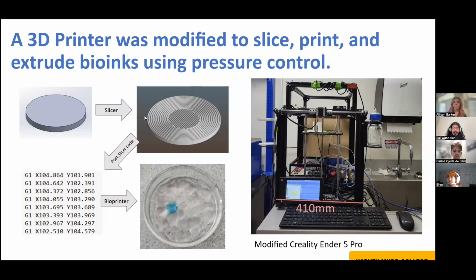In order to get the bioprinter to print an actual file, we devised the following system, which corresponds to the flowchart on the left. First, the object to be 3D printed is added to PrusaSlicer, a program that converts a 3D model into a series of line-by-line instructions that would tell a conventional FDM 3D printer what exactly to do. These instructions are in a format called G-code. Next, the slicer calls a custom Python script to post-process the G-code into a form understandable by the bioprinter.